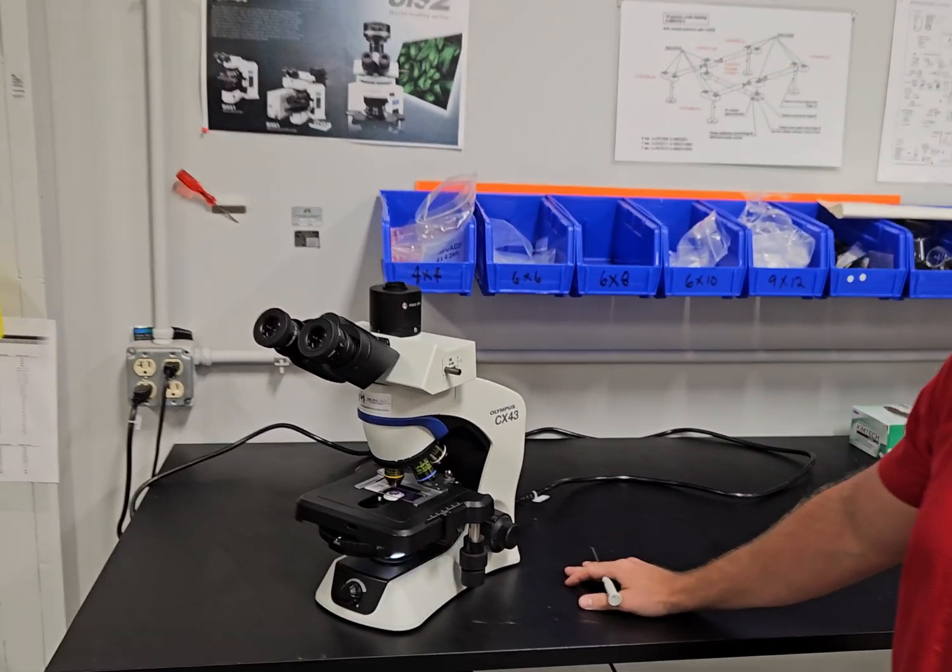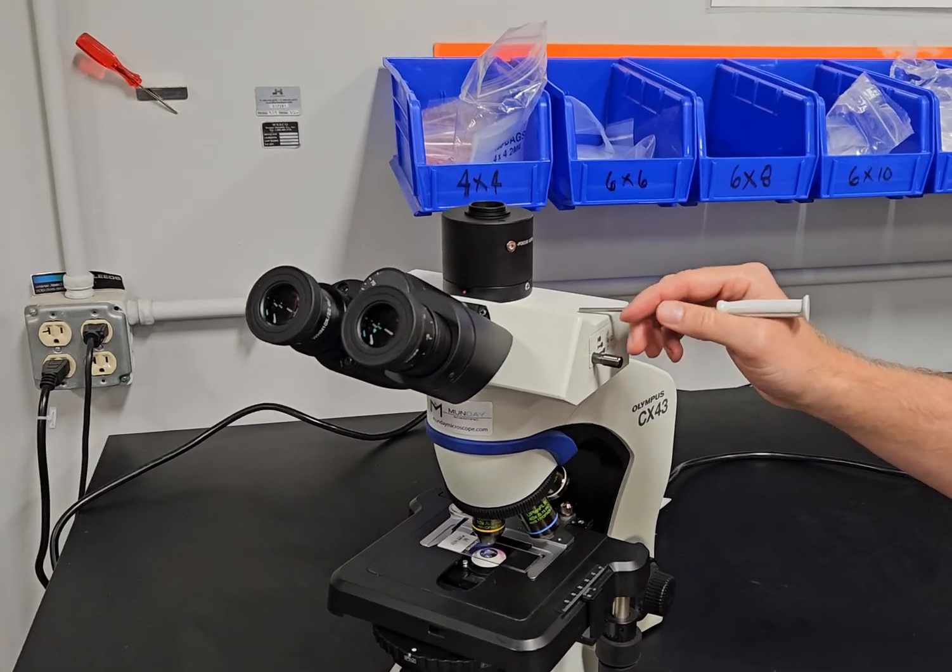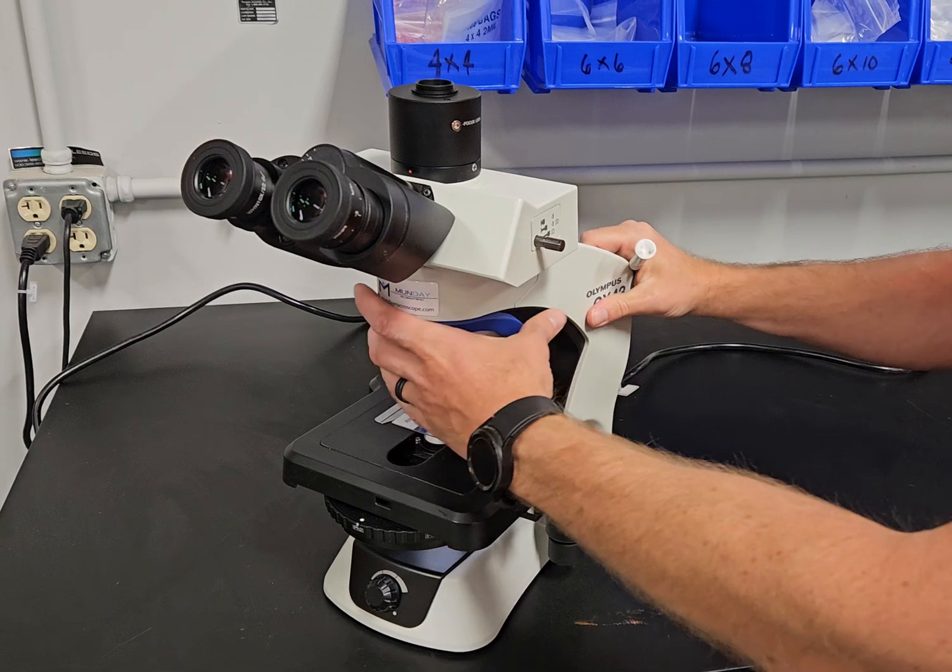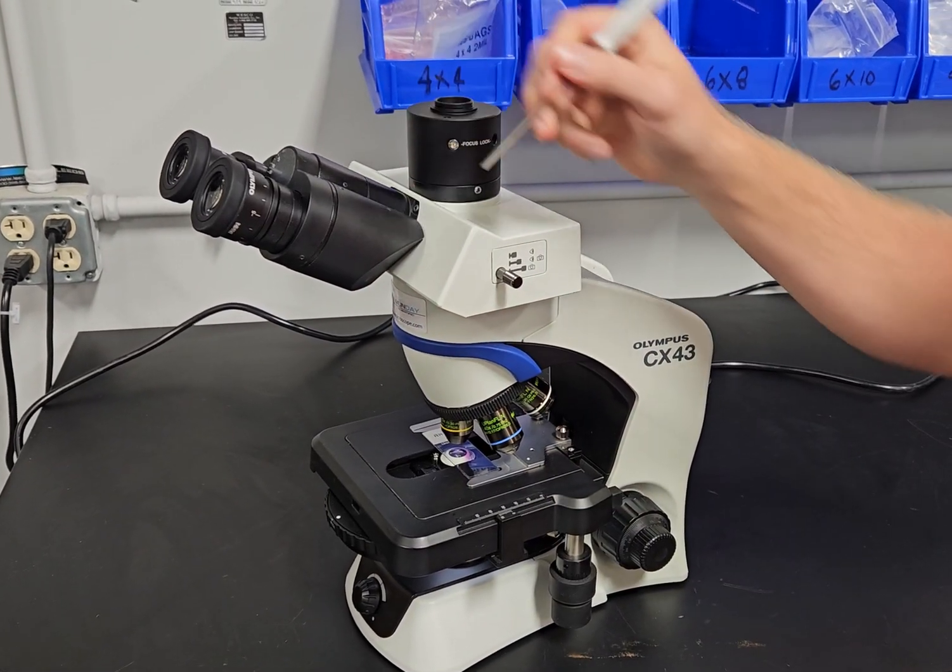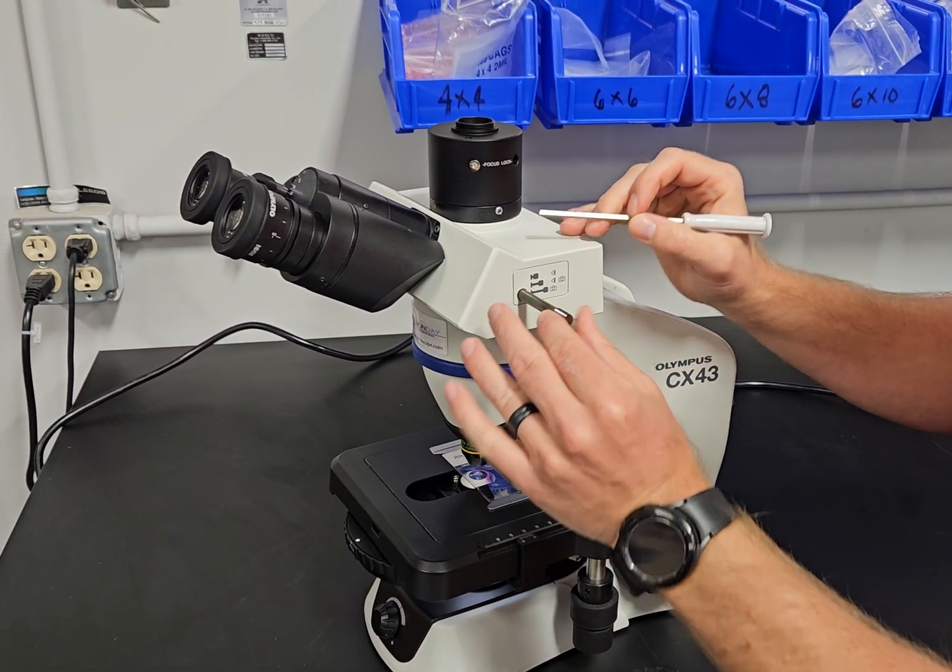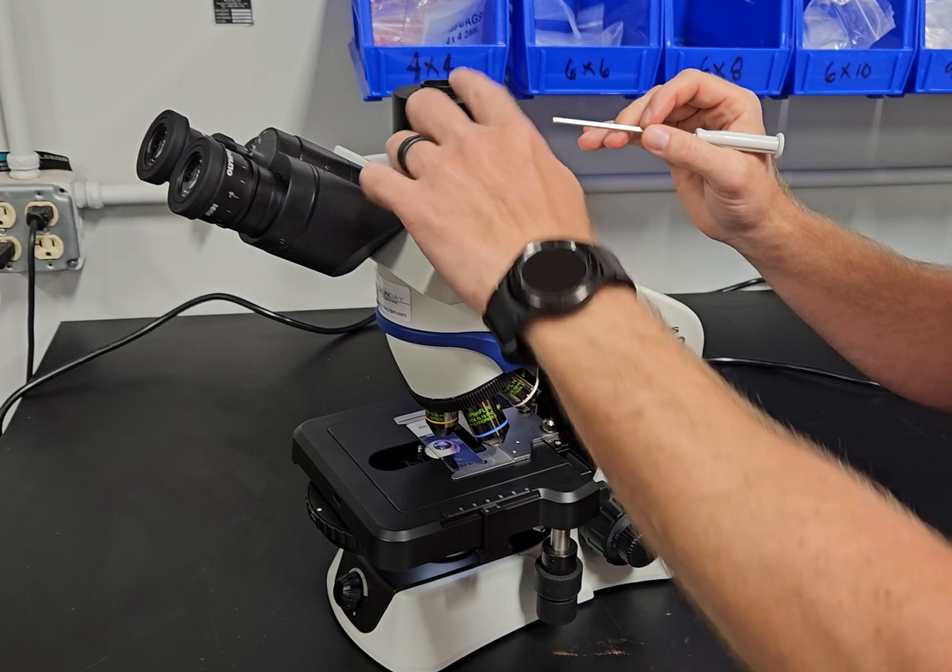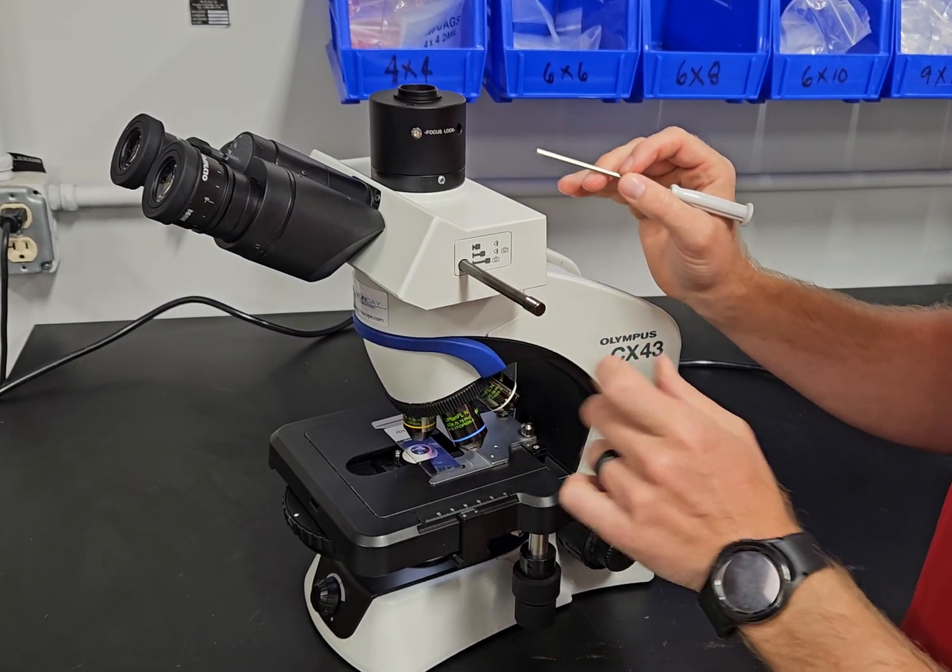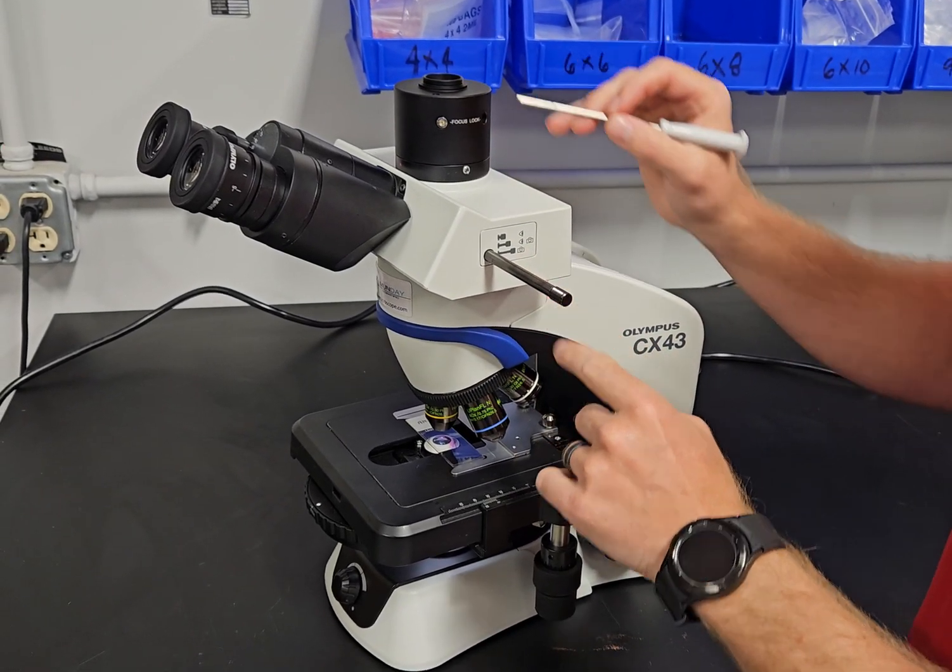Mike's going to come in here and we're going to talk about the scope. We have a trinocular head. The trinocular head has three positions: 100% position to the eyepieces, this splits the light between the eyepieces and the camera tube, and this is 100% light to the camera tube.